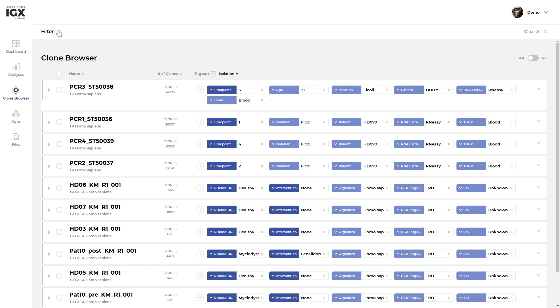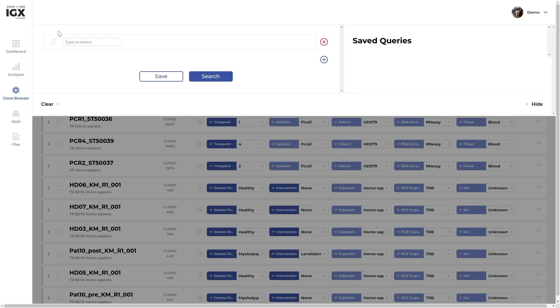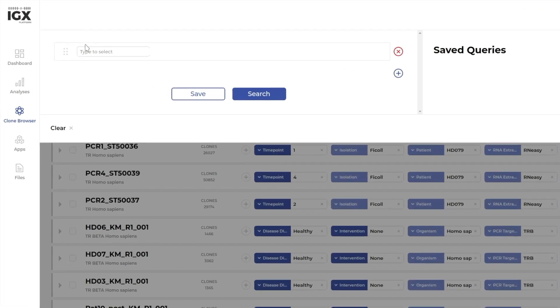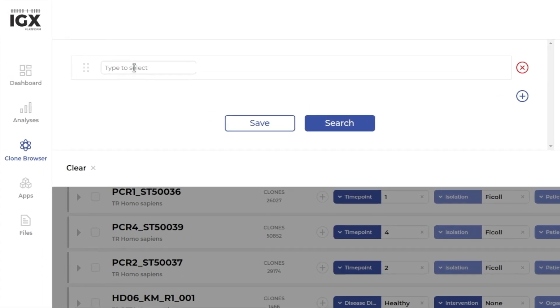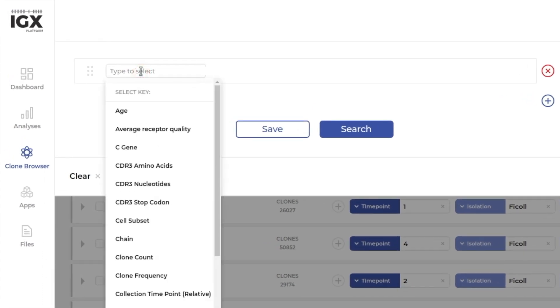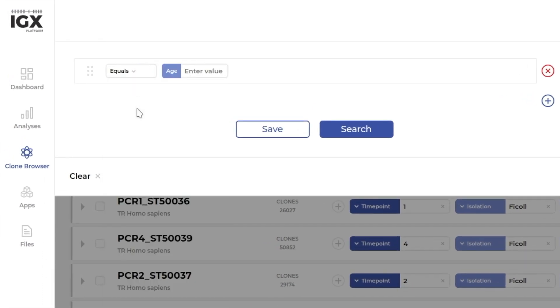In the top left corner, open the filter tool to start building your query, select a key from the drop-down menu, and enter a search value.